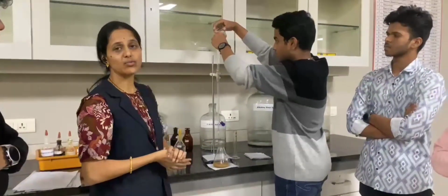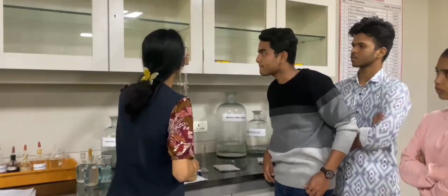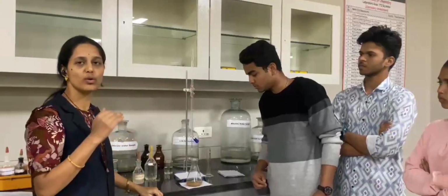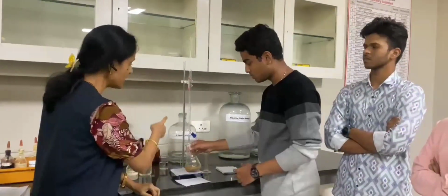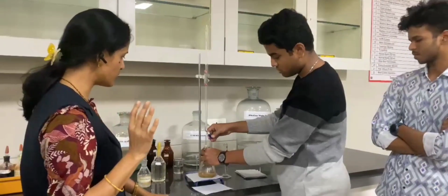Now the burette is filled with the sodium thiosulfate. Our end point is brown to milky white. So you have to adjust to zero. Now titrate this solution with the sodium thiosulfate till you get the milky white solution.